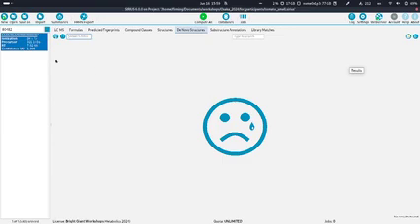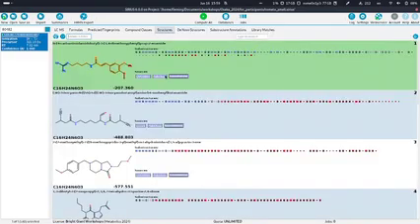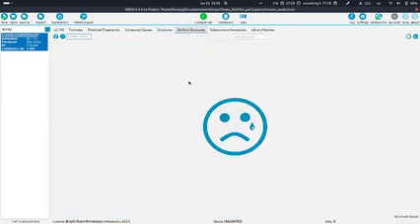We can run it now, but because it takes a little bit of time, I'm just going to skip this. Kai already had a slide where he showed what the hits in MS Novelist look like. You just get a list which looks very similar to the structure hits, but you will see that the source for this structure hit will be de novo, so it was predicted by MS Novelist.